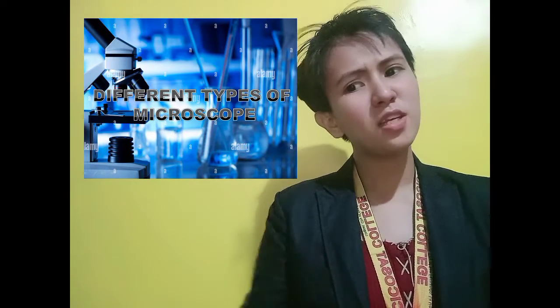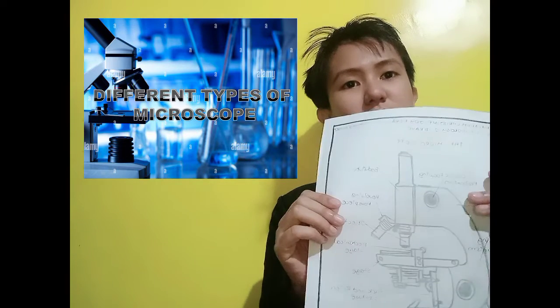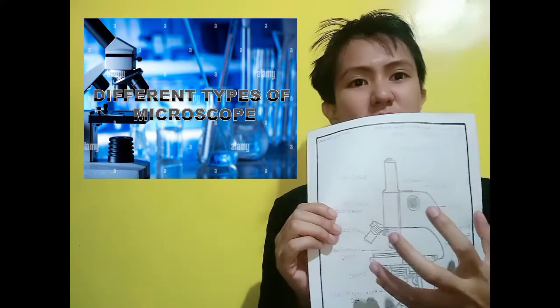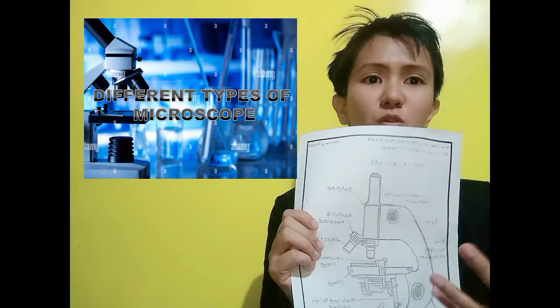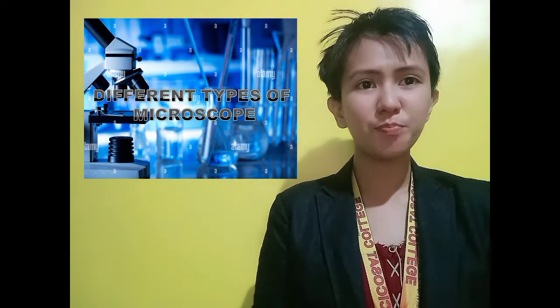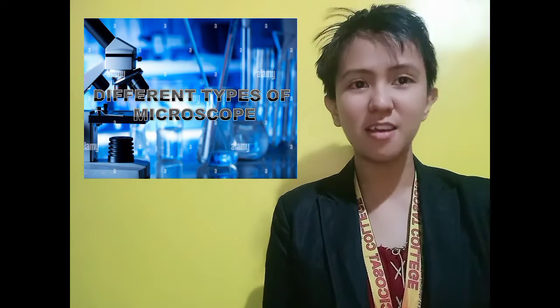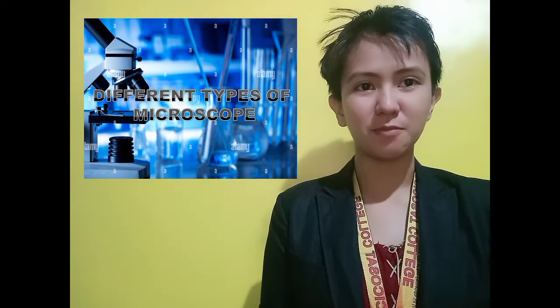So, the next is the different types of microscope. Gaya nga nung kanina, gaya din nung picture kanina sa microscope is may iba't iba silang klase. So, atin nang tatalakayin yung mga iba't ibang klase ng microscope.